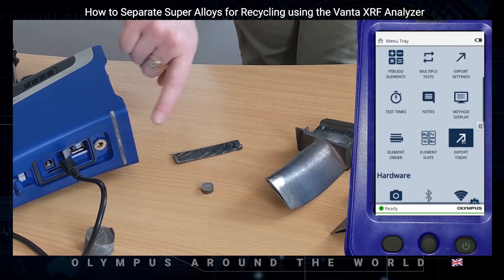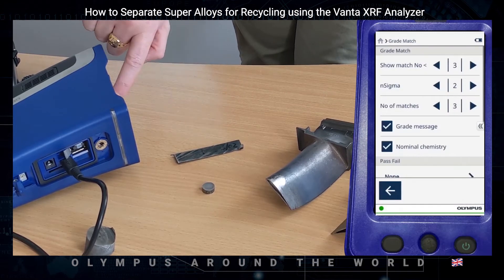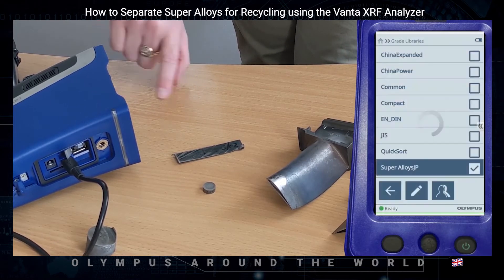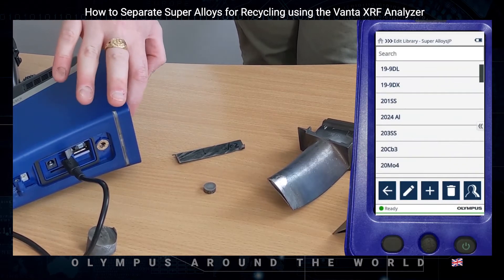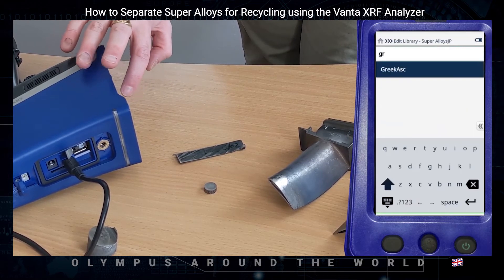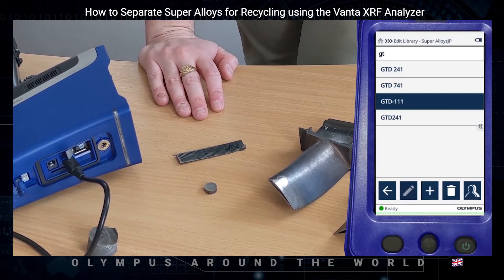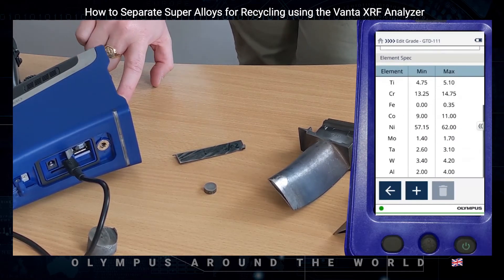I'm using a custom grade library I created with a customer where the tolerances for each element have been edited to allow for faster grade separation. If we go into the main menu, into grade match settings, we can scroll down to libraries — this is my superalloys library. We can highlight it, click on the edit button, and see all the grade specifications listed. We can also search for specific grades, and by clicking the pencil icon, we can edit that grade specification directly on the analyzer and change the minimum and maximums.